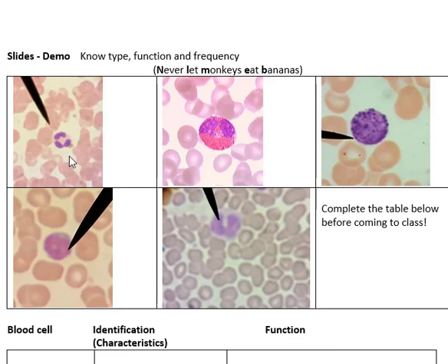This one is a polymorphonuclear leukocyte, or PMN for short, also called a neutrophil. You can tell this one because it has a multi-lobed nucleus. Polymorpho means many-shape, nuclear refers to the nucleus, and leukocyte means a white blood cell.